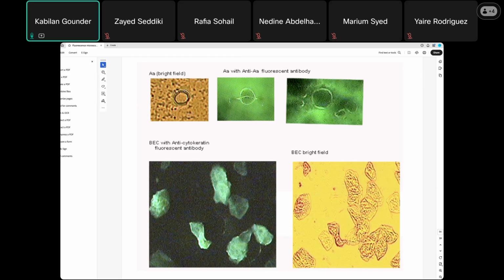Because the AAE protein is expressed on the outer membrane surface, you can see the outer membrane stained. This is a higher magnification. This study shows that the outer membrane protein AAE is expressed on the outer surface of the membrane.